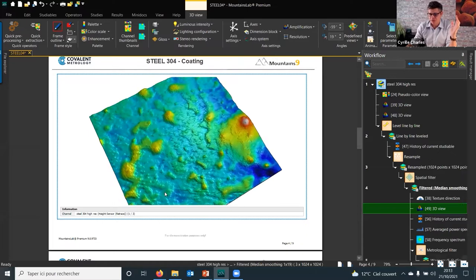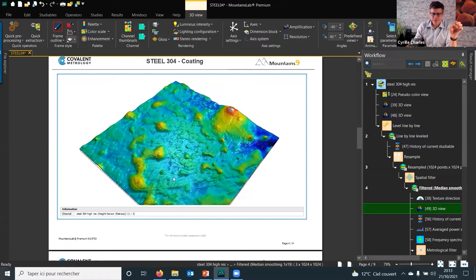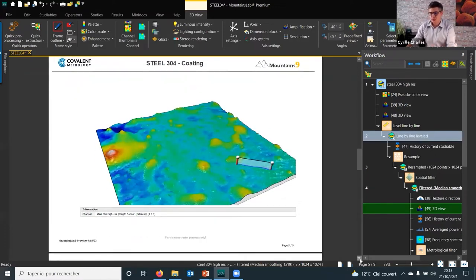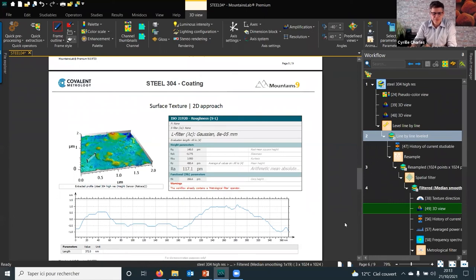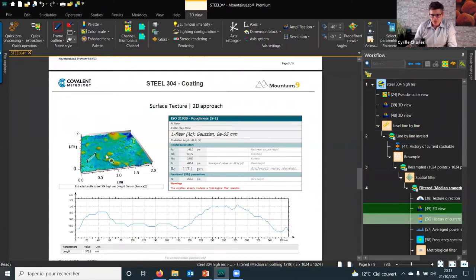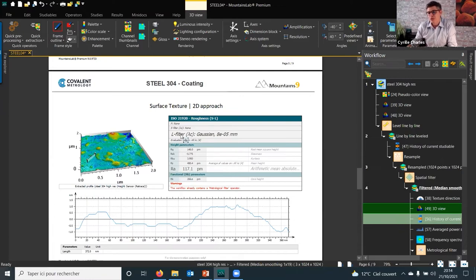On the next page I wanted to extract a profile, because when we say roughness we can mean 2D or 3D roughness. Roughness in 2D is called RA. From this profile I wanted to analyze some features. You can see the surface with a profile — this blue line is a profile from this area — and I displayed a table showing the roughness RA value.